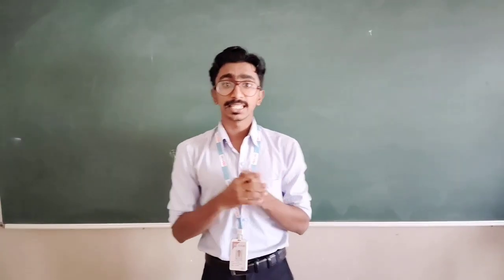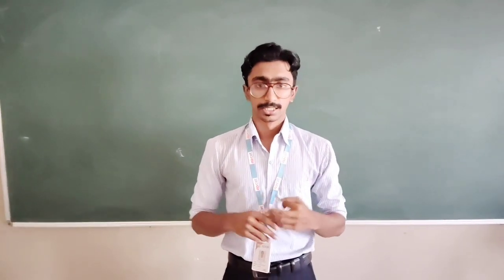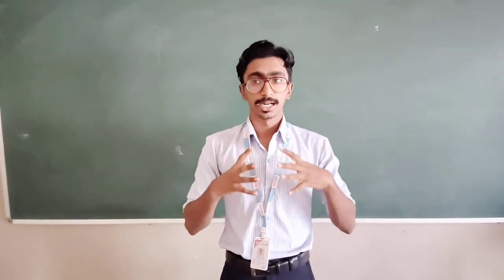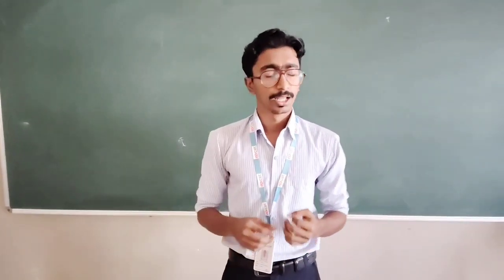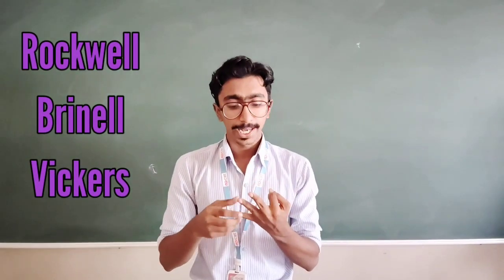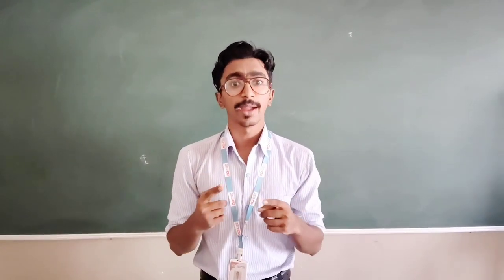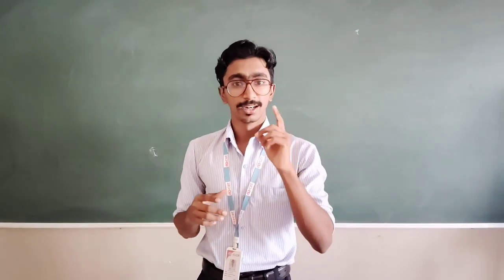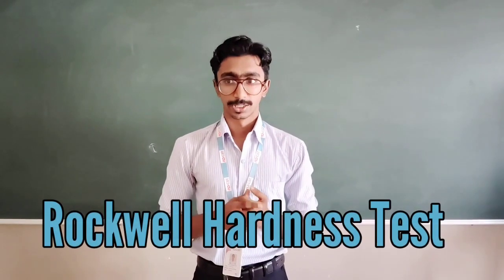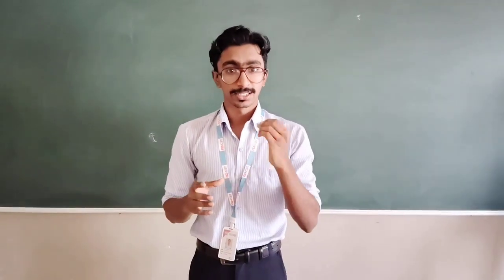This hardness test has three experiments, meaning in three ways we can conduct the experiment. The three ways are Rockwell, Brinell, and Vickers. Out of these, today I am going to show you the experiment that I mentioned in the earlier video, which was the Rockwell test.